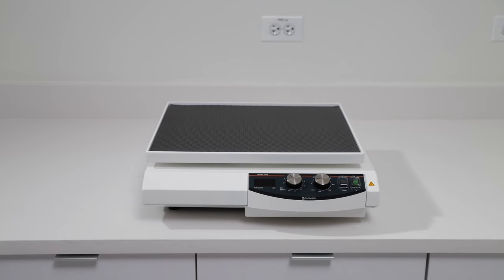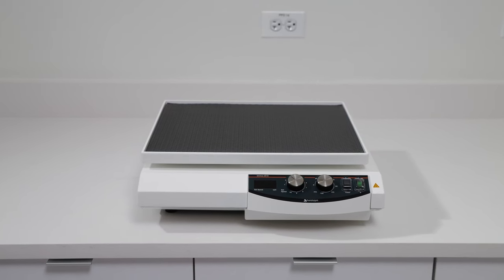The second Unimax model is the Unimax 2010. The Unimax 2010 is perfect for high sample throughput applications. This is done in a variety of ways.